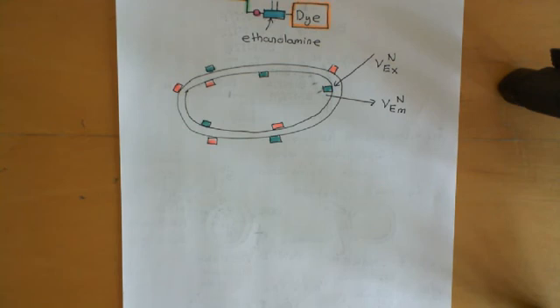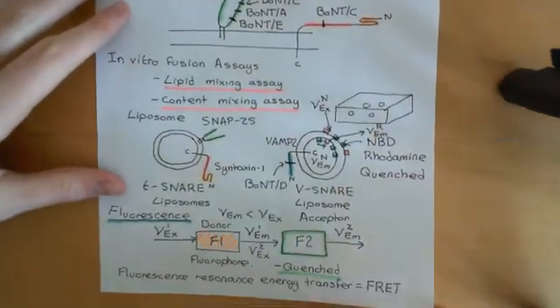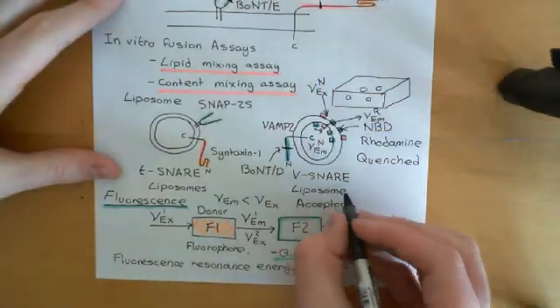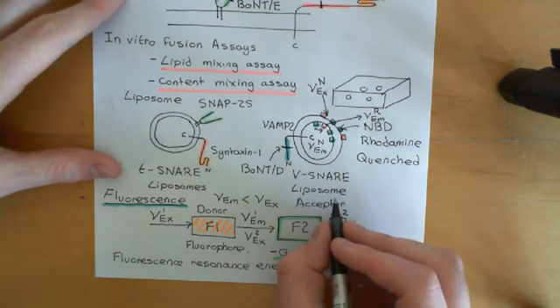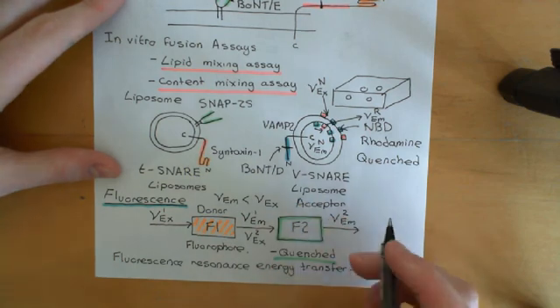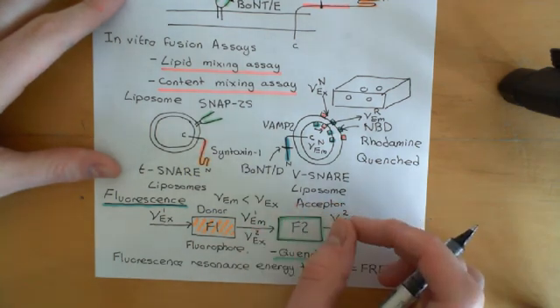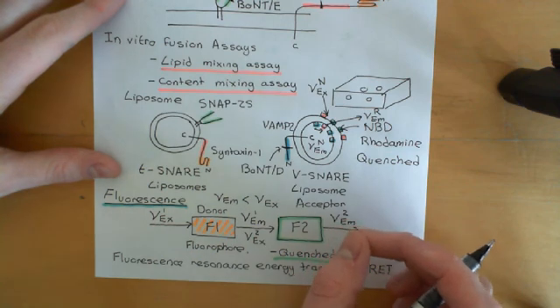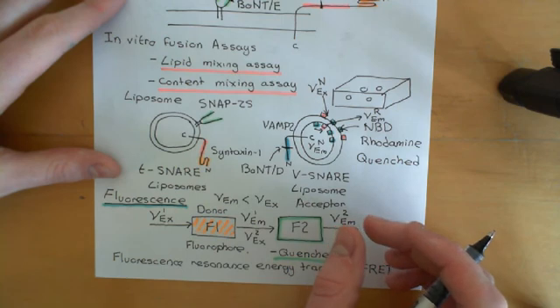to have these V-snare vesicles with very high copy numbers of VAMP2 within them. Okay, so these liposomes here, these V-snare liposomes, and I'm sorry I keep mixing up liposomes and vesicles, they are fundamentally the same concept. Liposomes are an experimental construct, and vesicles, of course, contain a huge number of different proteins.